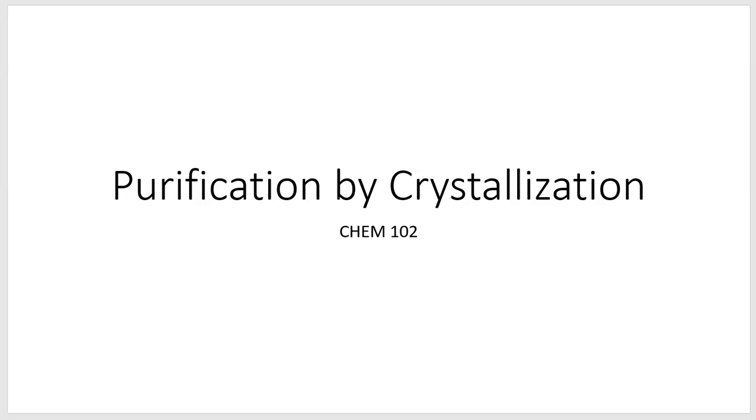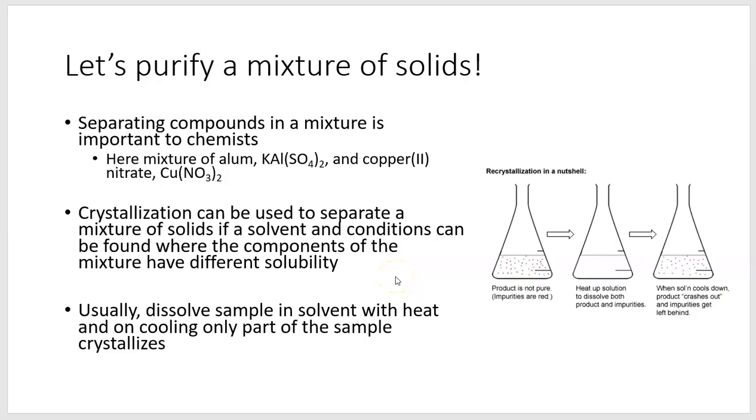Hello, this is a short video as a pre-lab lecture for the Purification by Crystallization experiment in Chem 102. And our goal today is to purify a mixture of two solids.